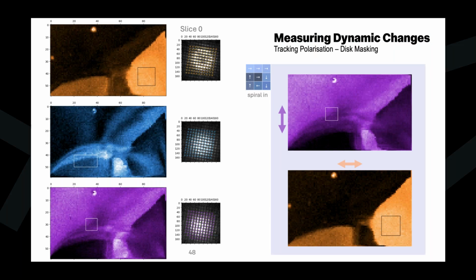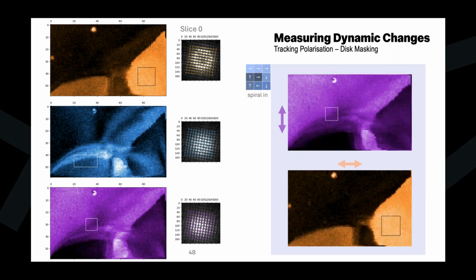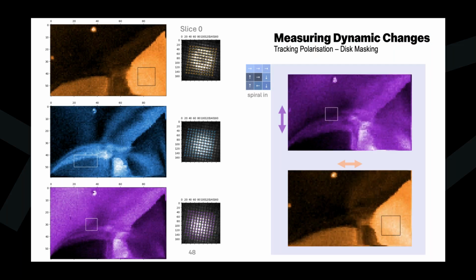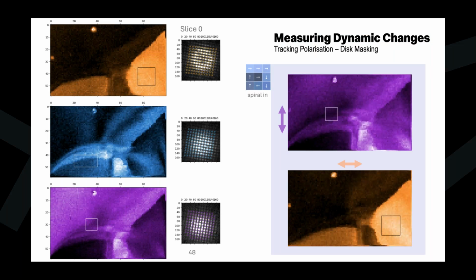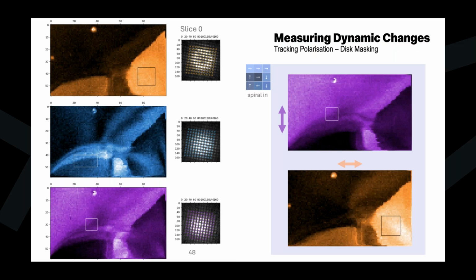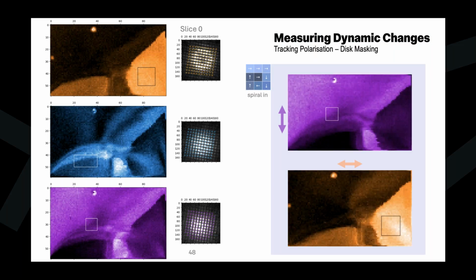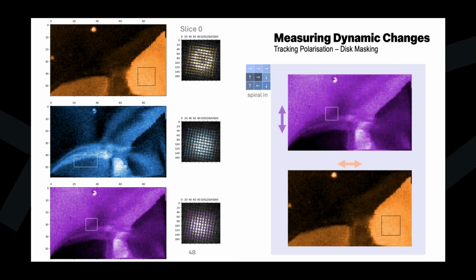And we investigated how those domain patterns are affected by the different scan patterns. We could see this before, as I said previously, where if we just rotated the scan, they were moving in different directions. But this now is allowing us to change our scan pattern directions and make very different types of walls and interfaces. We can already see that what we're forming now are these vertex patterns that we hadn't seen before, and we're trying different types of scanning directions as well to hopefully induce more chirality in these domains.